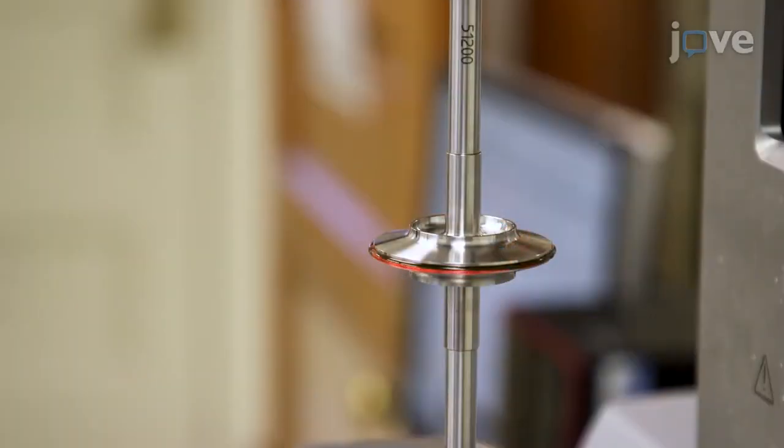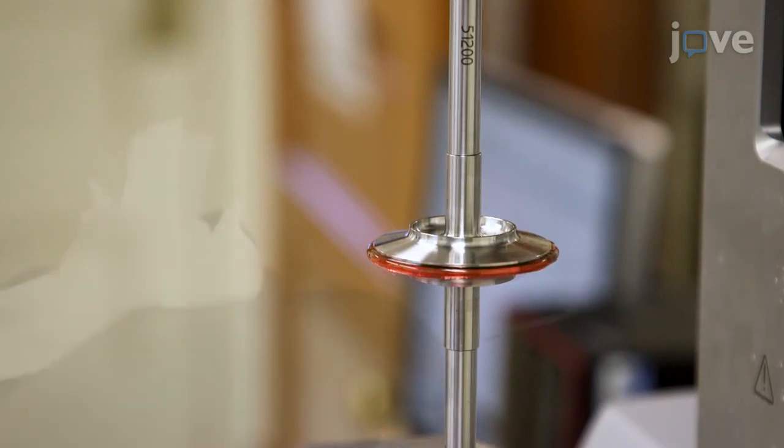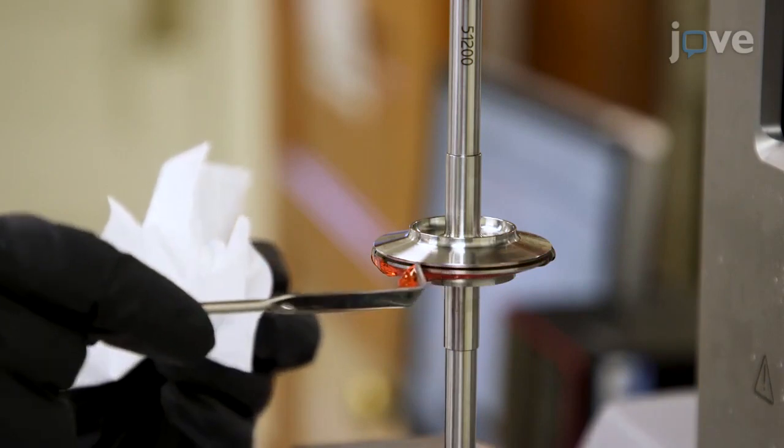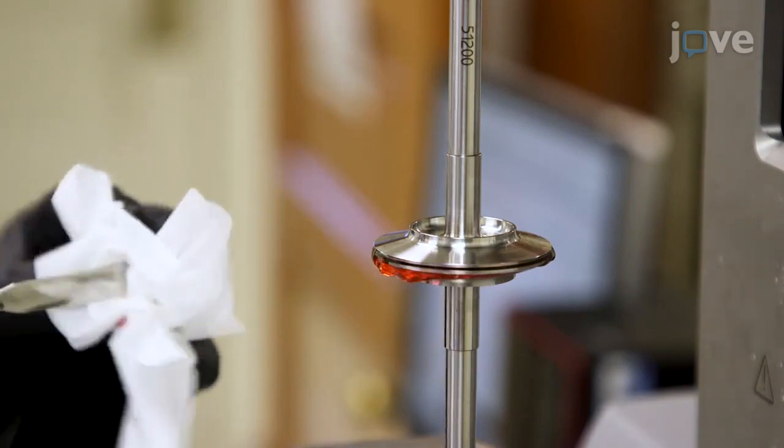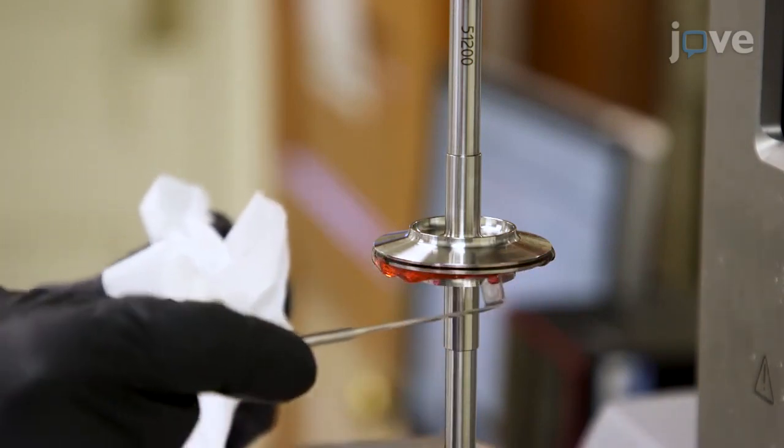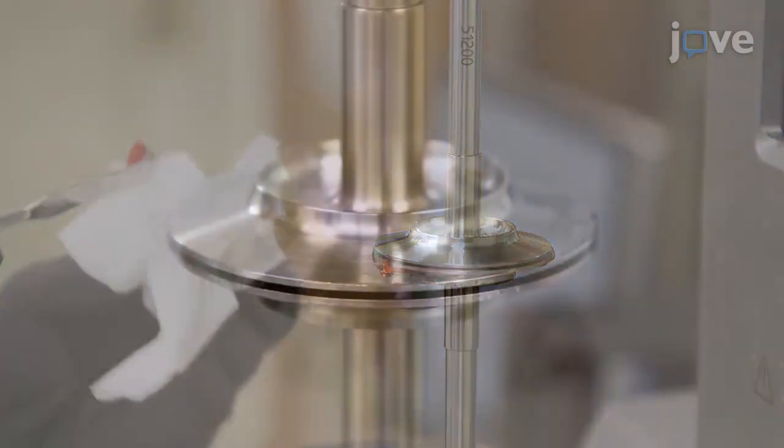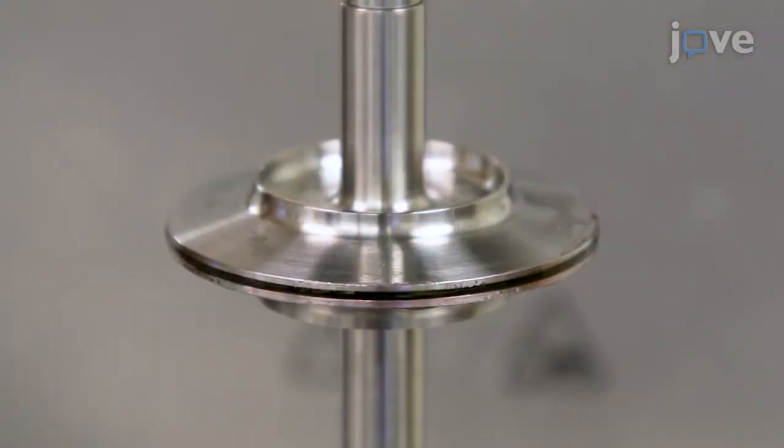Work with the measuring system set to Trim Gap. Use a square-ended spatula at the edge of the geometry to gently trim excess material. Return to the measurement gap before continuing.